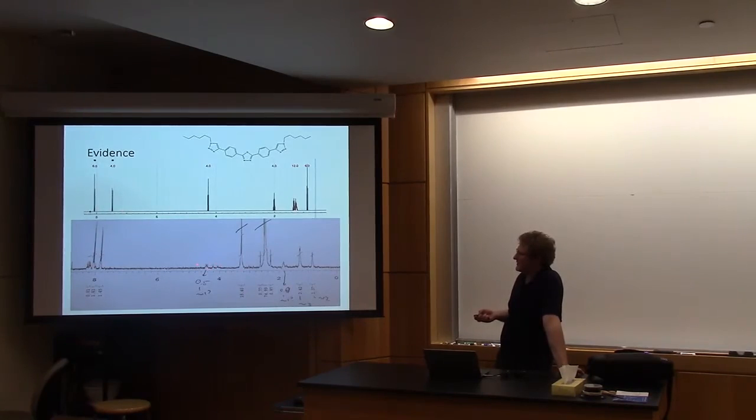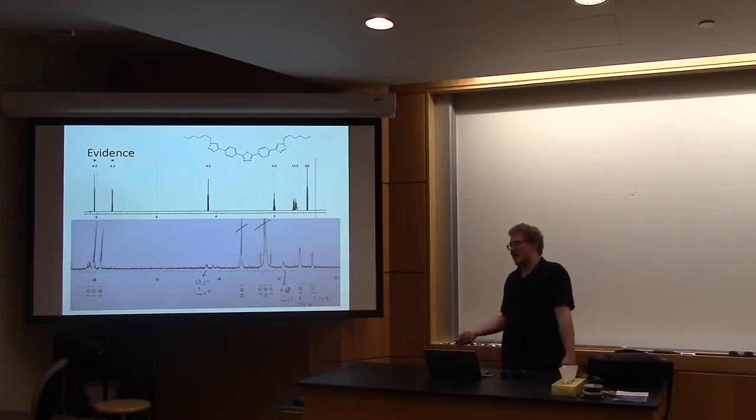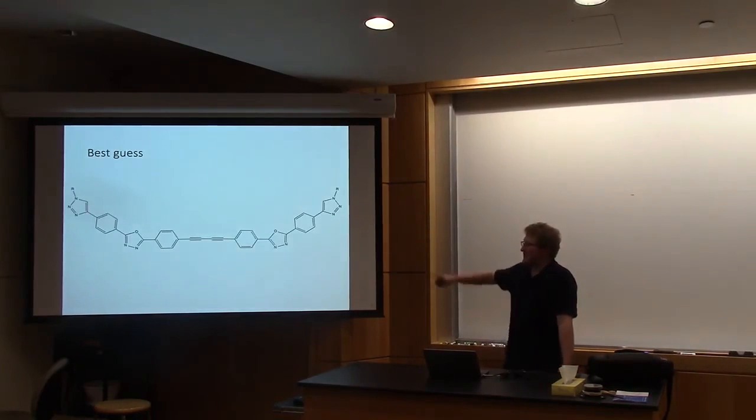And here, though, things start getting a little weird. There's a very short peak, and it's a little too high from where it should be. And over here, these three peaks are all just completely in the wrong spot. But what happens if you look a little closer is that the integration values don't actually line up. These over here are double the value that they should be, which means that either one of these tails didn't get added on, or something else a little bit different happened.